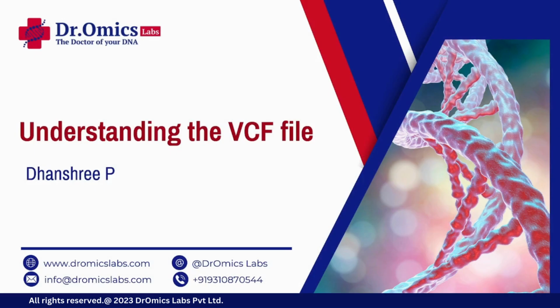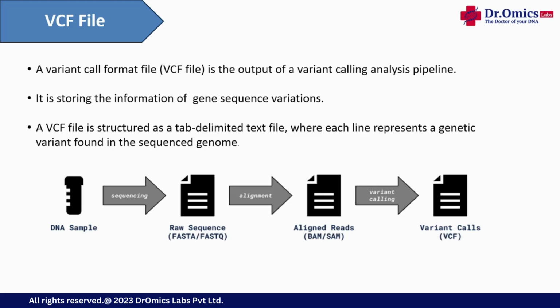In this topic, we are going to discuss understanding of VCF. VCF stands for Variant Call Format. Actually, it's an output of the Variant Calling Analysis Pipeline. As in the last part, using the GATK HaplotypeCaller, we called the variants and that output was generated in a VCF file format.